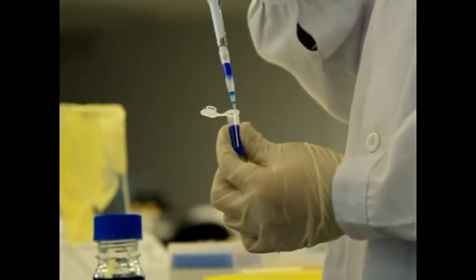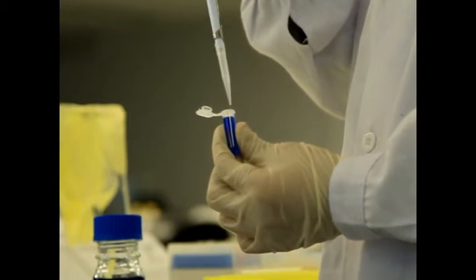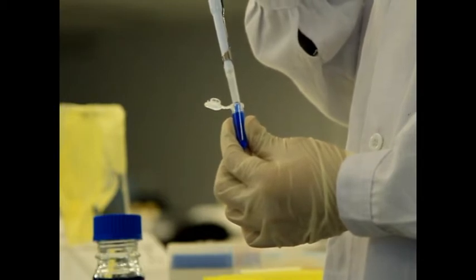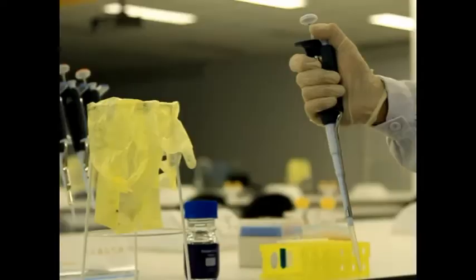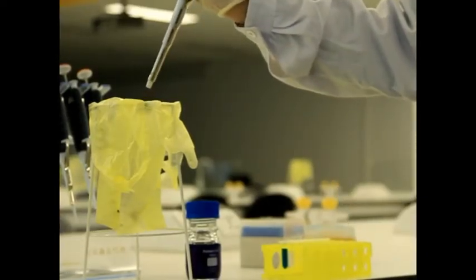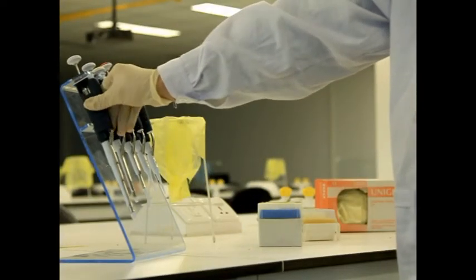If this happens, dispense the sample and try again by pressing the push button to the second stop in order to expel the incorrect sample in the pipette. Only release the push button after the tip has been removed from the sample. Change the tip after each sample. After dispensing, you need to store the instrument vertically and especially avoid a cross-contamination of the tip.